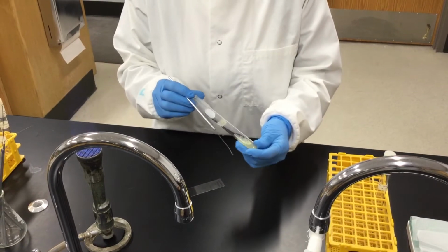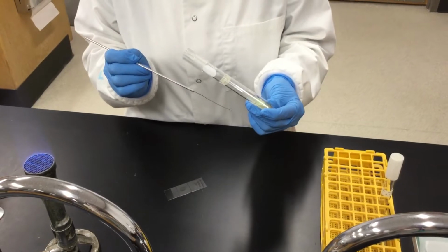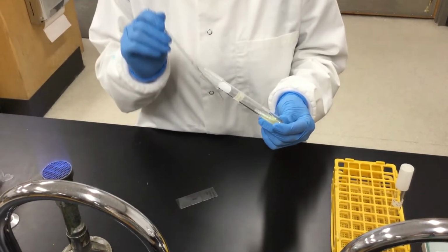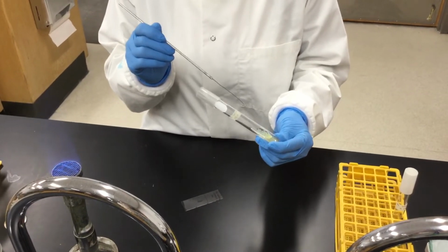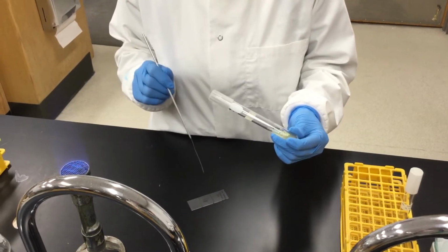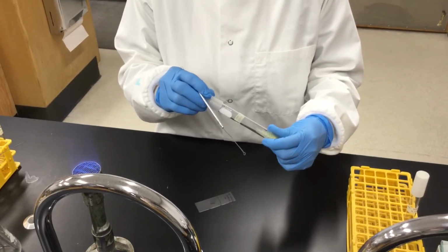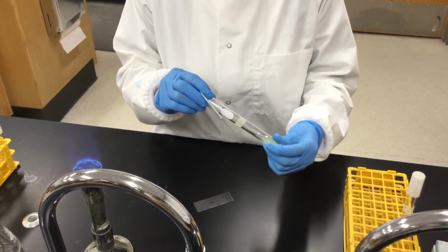And when you are grabbing bacteria from your slant, you're going to follow the same angle. Usually, instead of grabbing it from the inside of the loop, you just touch the bacteria, the yellow colonies that you see there, with the outer edge of the loop, and then you put it in the water that you have on your slide. It doesn't matter if it doesn't look like you have a lot of bacteria, because you actually do. Sometimes you can make a very thick smear, and that's not good.